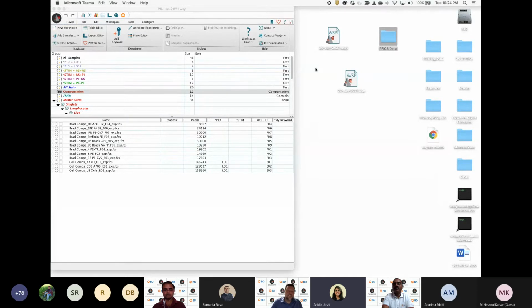We have started seeing responses. We have 15 responses so far, and all of them are saying all of the above. So Amlan, would you like to speak further? Yeah. Good job. And that is the correct answer, right? Yeah, good. Transformation is all about rescaling, but it is a visual display, the underlying values are not changed. Good job, team.